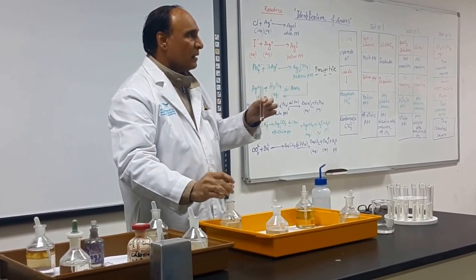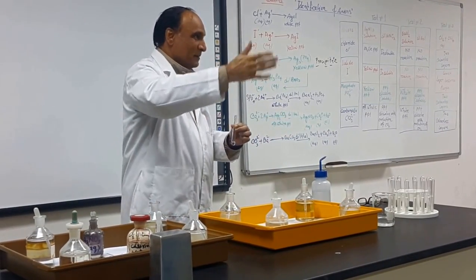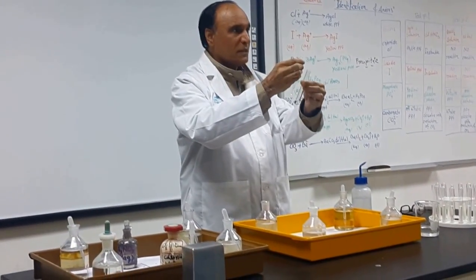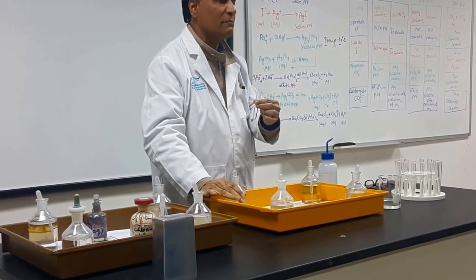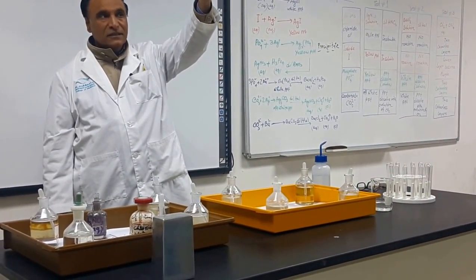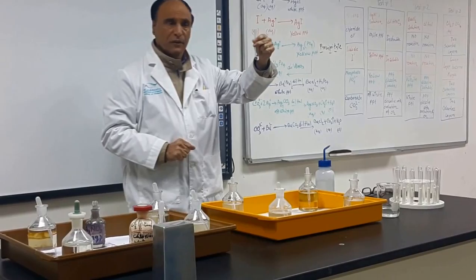What does contaminate mean? Not bacteria, some other chemical. Translate contaminate. Contaminate means something else in the test tube. If I put it back, the whole solution becomes bad, not useful. This much quantity. Don't take more than this. This is about 15 to 20 drops. No need to count it. About 15 drops.